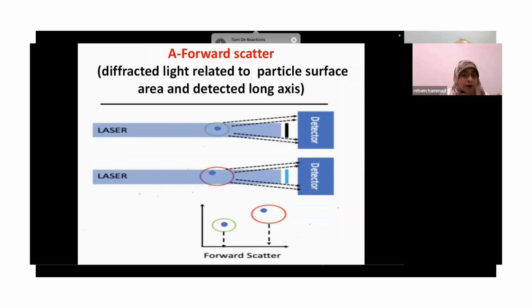So now, in the details, we talked about checkpoint inhibitors and their application for solid tumors or leukemia and lymphoma. The more the particle is large, the more it is going to enlarge the signal, and the larger the particle, the more it is going to shift the channel.